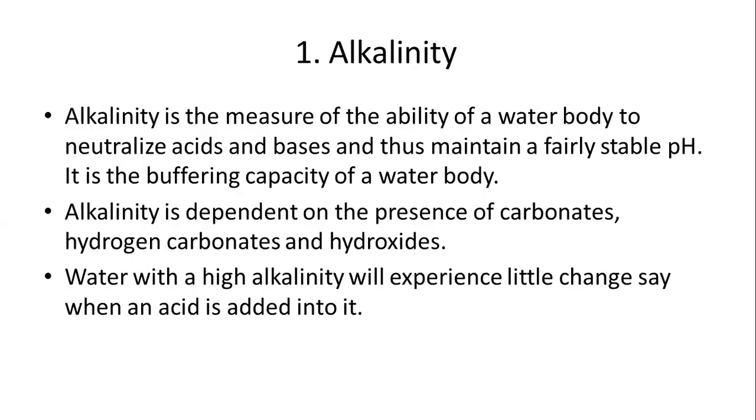So the next slide, we'll start with alkalinity. Alkalinity is the measure of the ability of a water body to neutralize acids and bases, thus maintaining a fairly stable pH. It is basically the buffering capacity of a water body. So what we're trying to see is whether we can add any acid or base to our water without interfering with its ability to carry on with its activities.